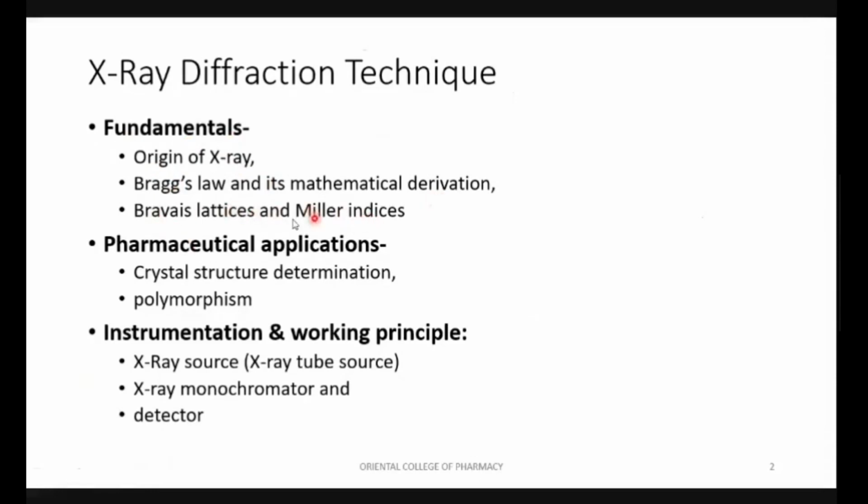Now, this part is not there in the syllabus of MPharm. Then there is the pharmaceutical application part, crystal structure determination and polymorphism determination. Then there is instrumentation and the working principle of those instrument parts.